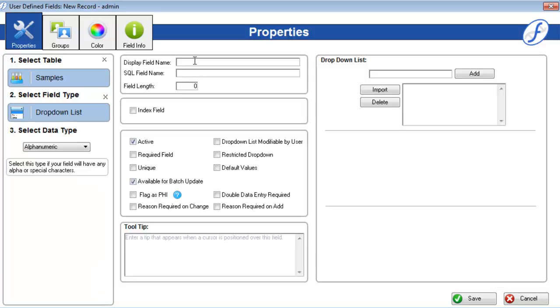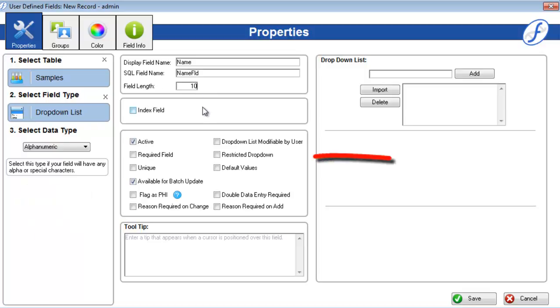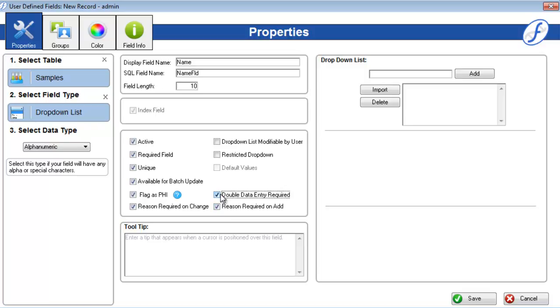Now the full properties page is visible, and you can name your field, determine a length if applicable, and check on whatever properties are necessary for this particular field. You can make it required in order to save a record, mark it as unique so every data entry is different, flag it as PHI so the data is protected, require reasons for the audit trail upon any modification or initial entry, require that the data be entered twice for authentication purposes, and more or less options depending on the type of field chosen.